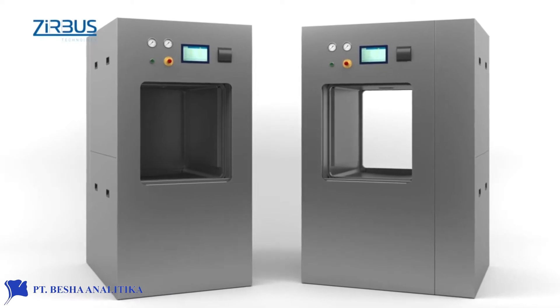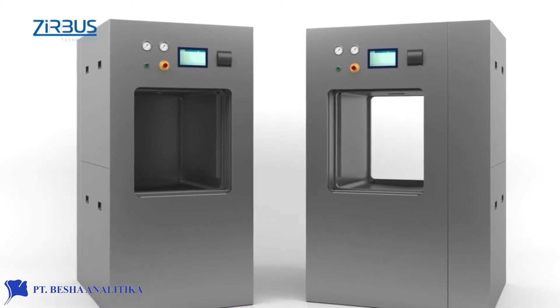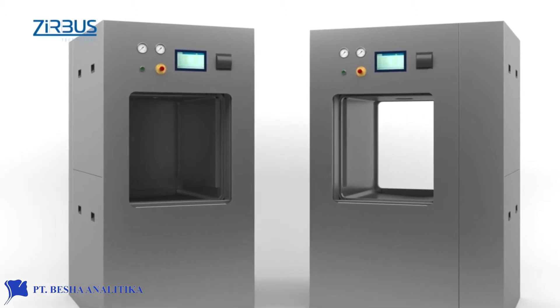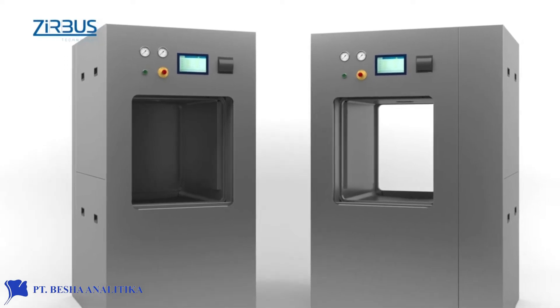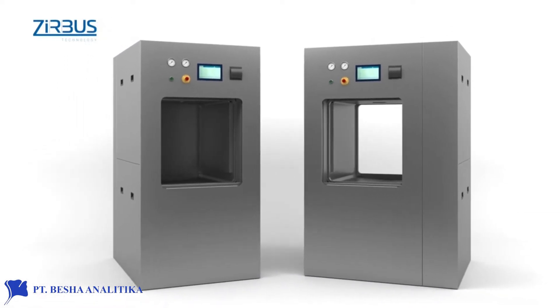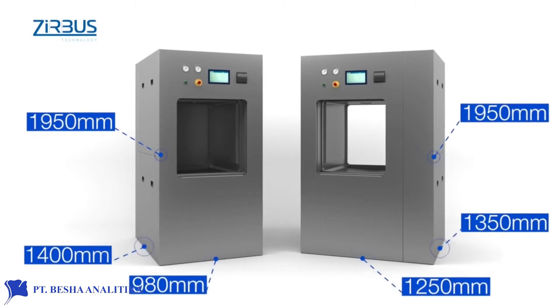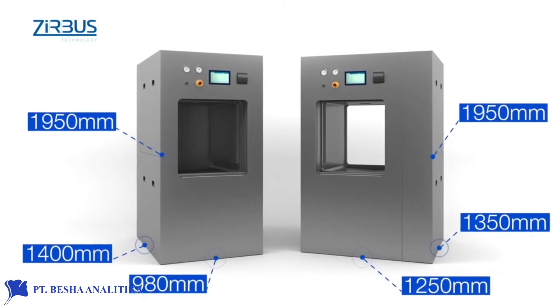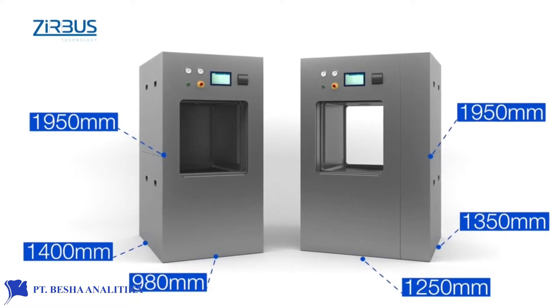Unlike the cylindrical chamber model, this sterilizer chamber is rectangular, allowing virtually full use of the available volume. This compact design allows users to save space. Compared to those of other commercially available instruments, the exterior dimensions of the Series 6 autoclave are exceptionally small relative to the size of its chamber, allowing it to fit through most standard doors.